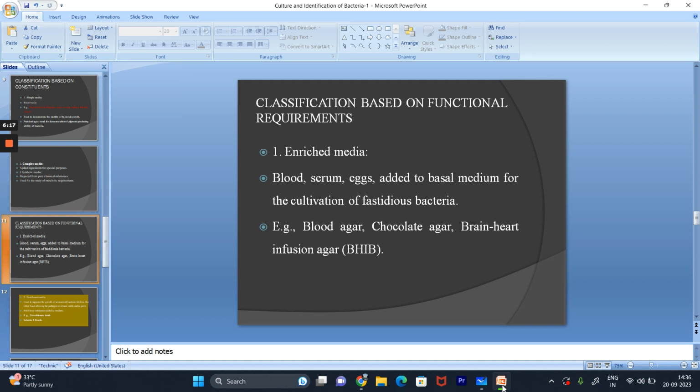The blood agar is a solid culture medium with agar, peptone and blood in it. Sheep blood is usually used, but we can also use horse, cow, and pig blood. It supports the growth of most aerobic and anaerobic bacteria, as it has special components in it like vitamin K, cysteine, and hemin supplementation, which promote the growth of anaerobic bacteria and some fungi as well. Blood agar is also used as an indicator agar, as it indicates the degree of hemolysis caused by hemolysin.